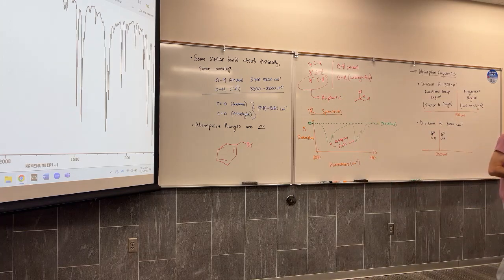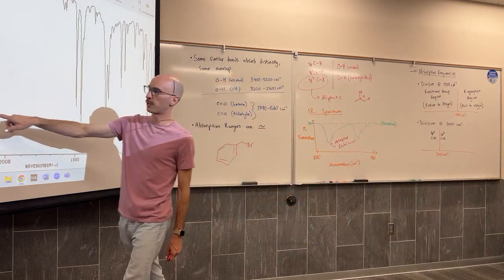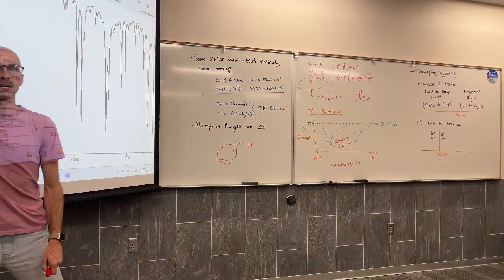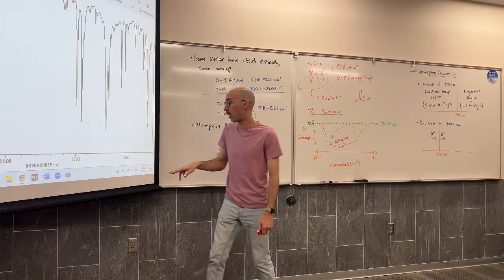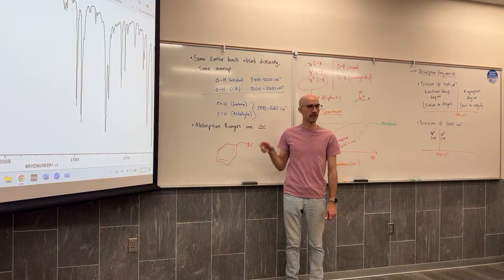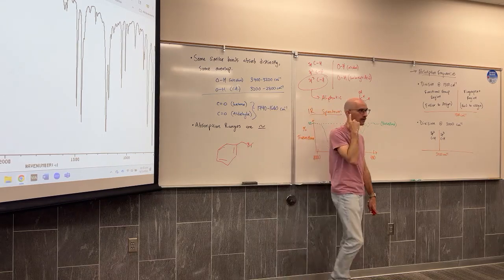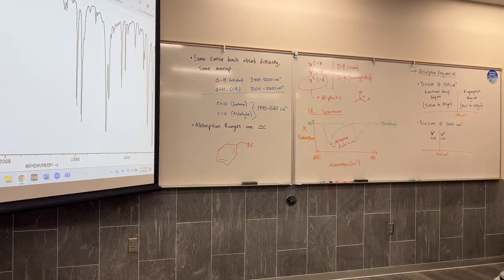And while you're at it, maybe you can look for the aromatic overtones caused by aromatic rings, usually several signals very weak in intensity. Use the correlation table to help you analyze this region of the spectrum.